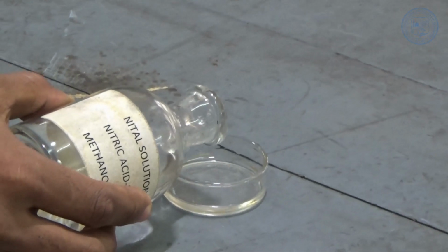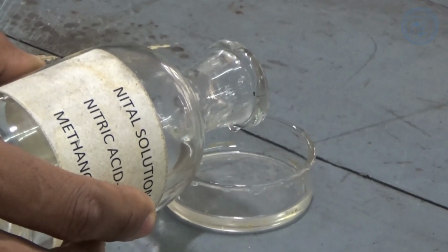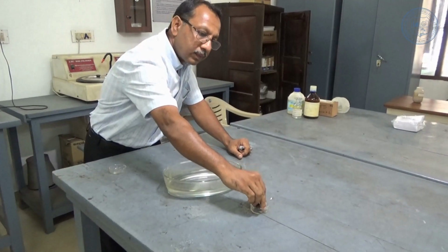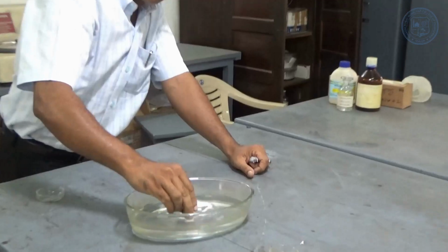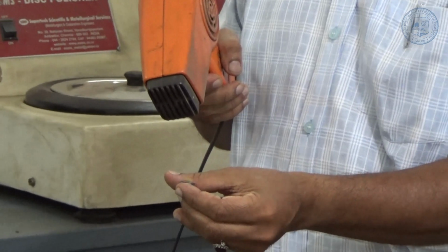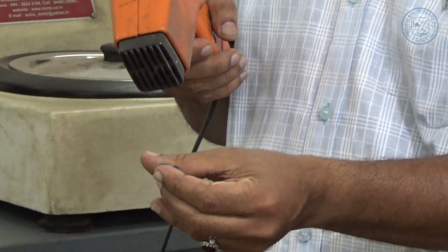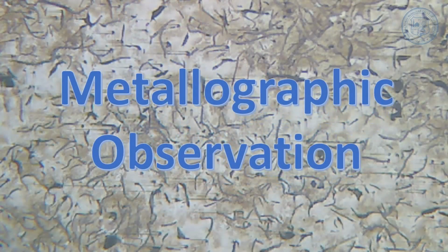A small amount of the etchant solution is prepared and poured into a small petri dish. The polished sample is then immersed in the solution for approximately 5 seconds. After etching, the sample is washed and dried. Drying is usually carried out with a hand dryer. Now, our specimen is ready for metallographic observation. Now let us see how we can observe the metallographic microstructure.